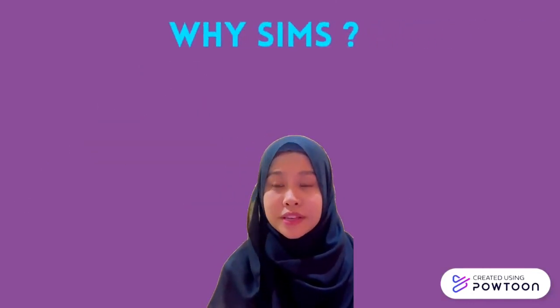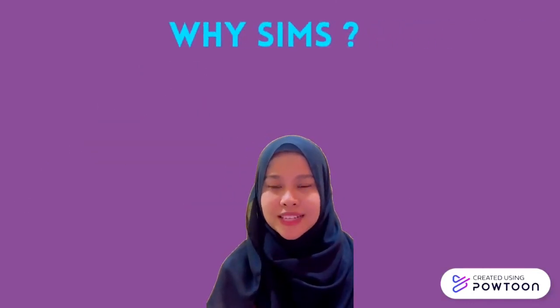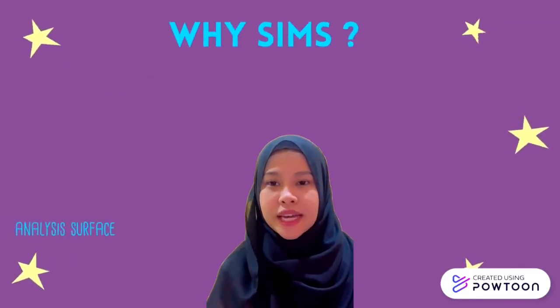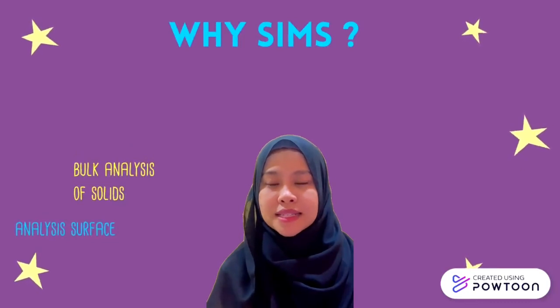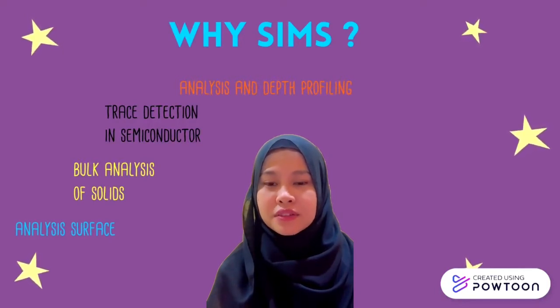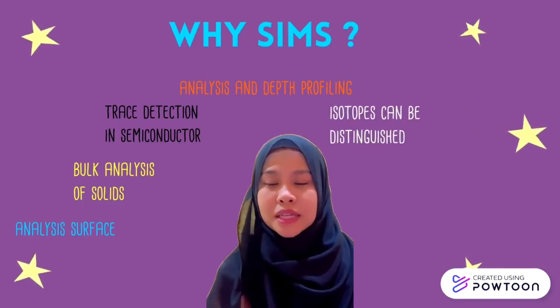Why do we use SIMS for depth profiling? Well, SIMS is generally used for the analysis of surfaces. However, it can also be used for the bulk analysis of solids. SIMS offers a unique application for trace detection in semiconductors, analysis and depth profiling of thin layers, or the imaging of surfaces. The strength of SIMS lies in the fact that all elements can be analyzed, isotopes can be distinguished, the detection limits are low, and the lateral distribution can be imaged.